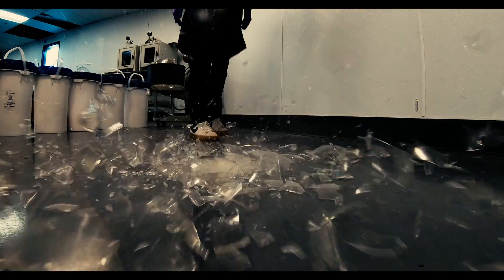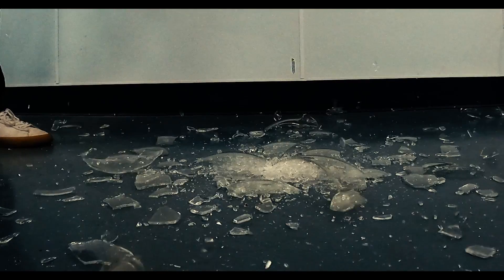If you want to be profitable in hemp extraction, you need to scale up everything. And the losses that happen when glass fails are too big.